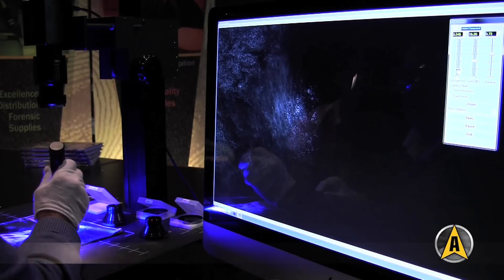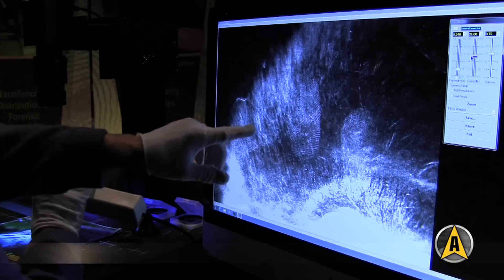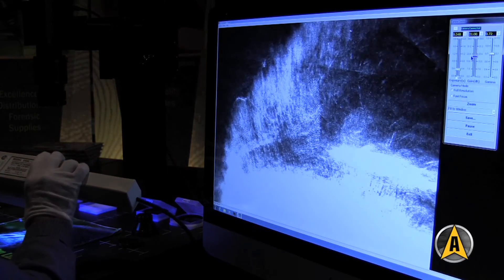If you look at the core of the fingerprint that we're fluorescing here, it's not very clear. You notice that you get a very good fingerprint even now around the core. You get a much better lift using reflective UV.